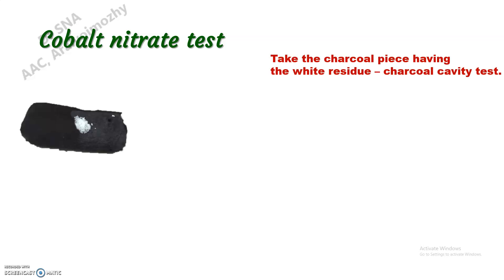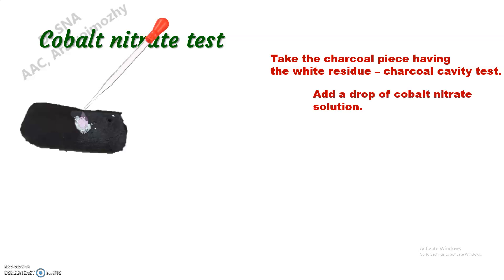For the cobalt nitrate test, take the charcoal piece having the white residue we got from the charcoal cavity test, and now add a drop of cobalt nitrate solution to it.